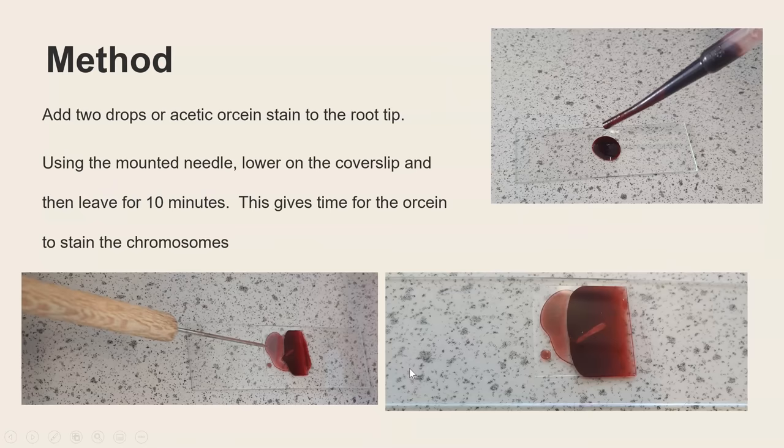Now we're ready to stain our root tip and you add just two small drops of acetic orcine. If you have too much then again you can add some filter paper next to it and it'll absorb the excess stain because you don't want so much that it'll then spill over the edges. You then use your mounted needle to carefully lower down that glass cover slip so that you'll end up with no air bubbles.